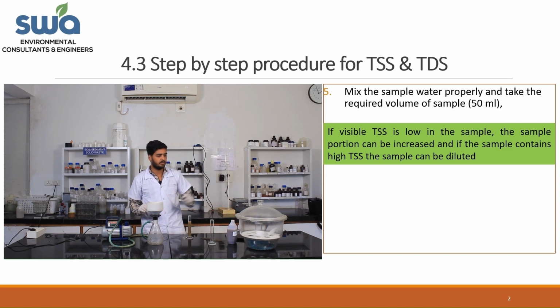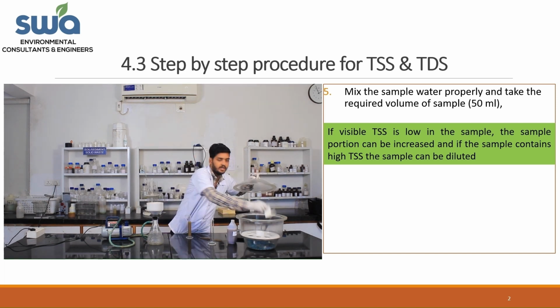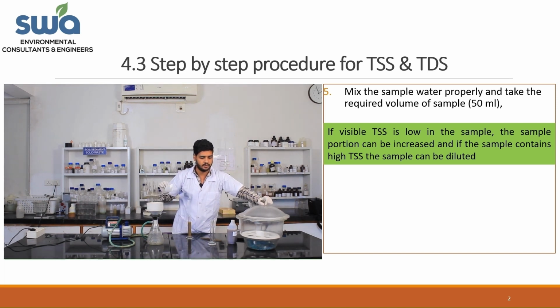After measuring the 50 ml of sample, here we have the filtration assembly. We will place this filter paper into the filtration assembly.